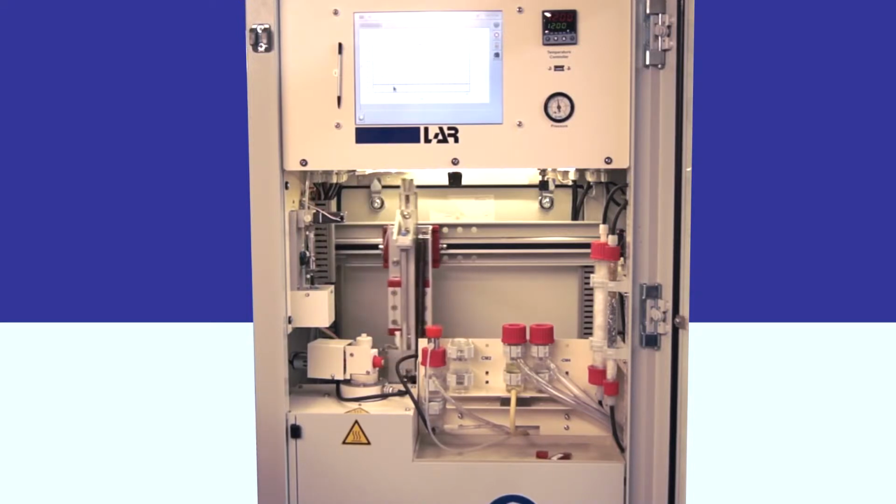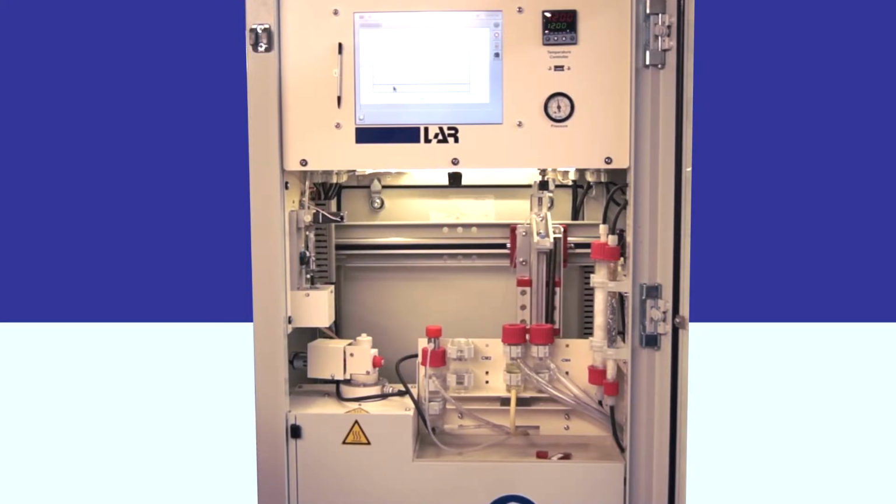The XY arm positions the needle over the drain vessel. The needle is lowered and 1 ml of DI or distilled water is flushed through to clean the needle, which is now ready for the next analysis.